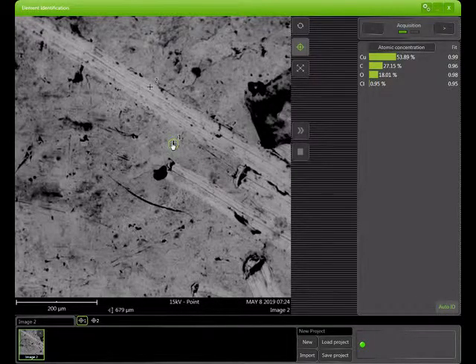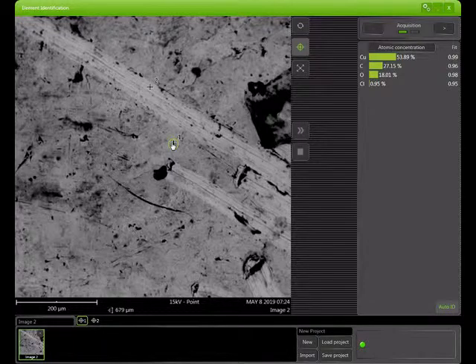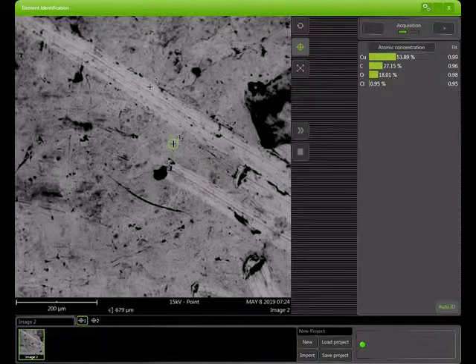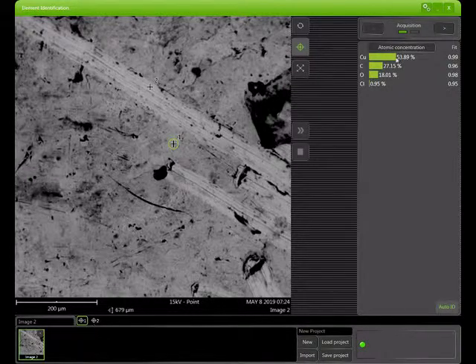It will actually, during the analysis, keep the beam in this area to analyze just that part. So we've analyzed a little bit of the dark part and a little bit of the light part.